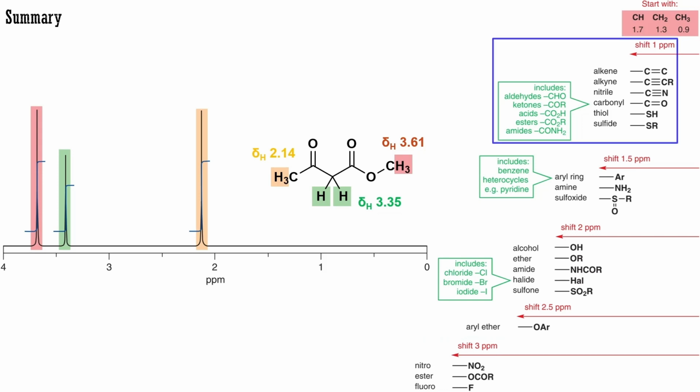The CH2 group is next to an ester and a ketone carbonyl group, and so we expect it at 3.3 ppm, an accurate estimate as it happens. We shall return to these estimates when we look at the spectra of unknown compounds.